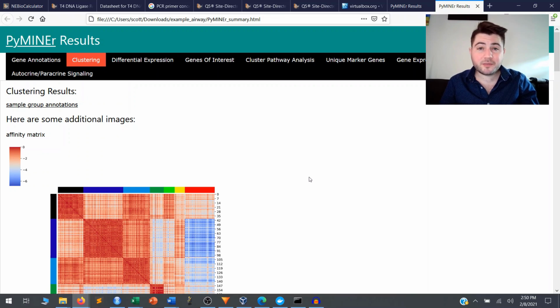So you should be able to do this, and I have used this on something as large as the Tabula Muris on a regular desktop computer, no high performance computing required. And it opens the door to running all these automated analyses and running things quickly, without needing to do all of the programming yourself.